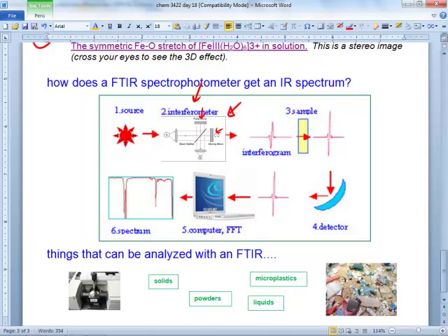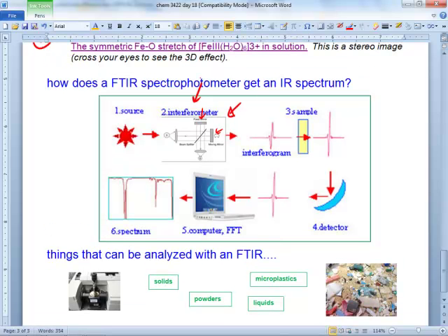Okay. What do they use as a source? Now, when you pop your stuff in there, you saw that little laser, right? Is that the IR source? No. That's how you can line it up, because you can't see IR energy. In the older ones, you had to have a little IR card, and you had to put it in there, and you'd see the IR energy. But here, they just have a laser going through there. You can see the path.